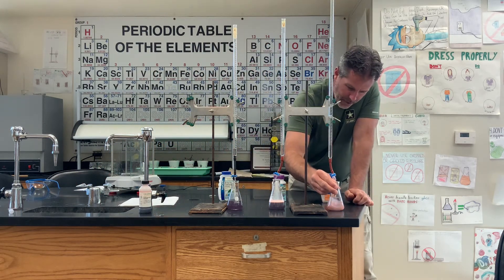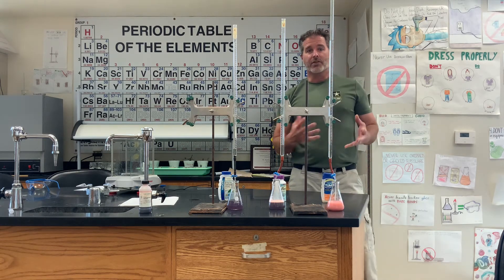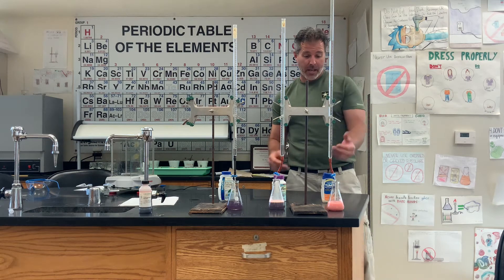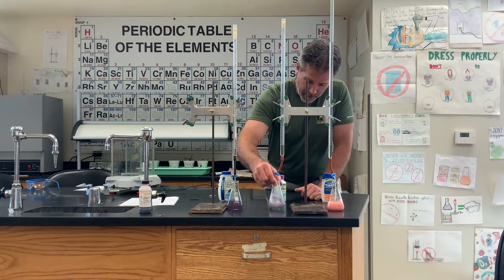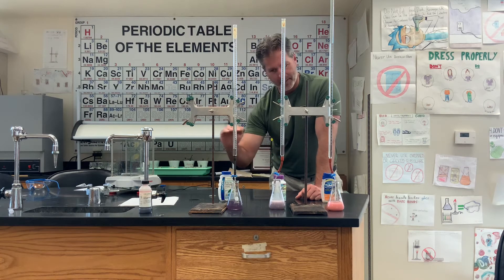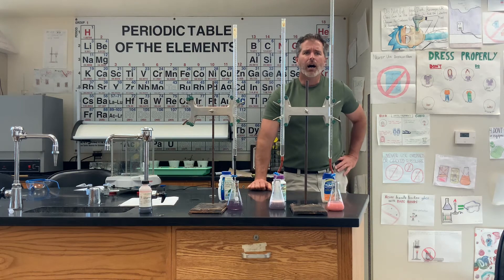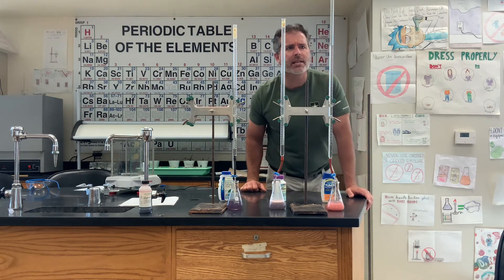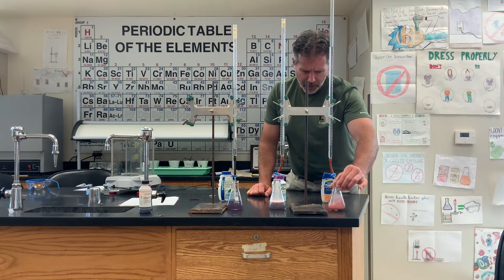The Tums is starting to separate out — hopefully you can see that color change. It's going from pink to purple. As I stir it, more of the antacid gets introduced to the hydrochloric acid and it changes back color — this is a typical titration. The Top Care one is definitely done, it's at that purple. The Tums is just passing 17 milliliters of 0.5 molar hydrochloric acid.